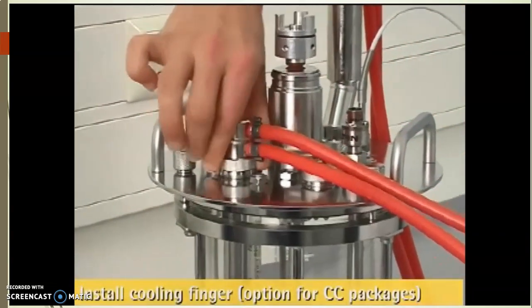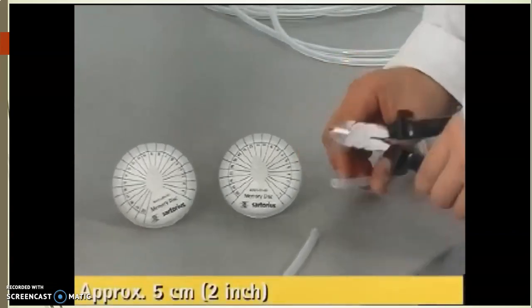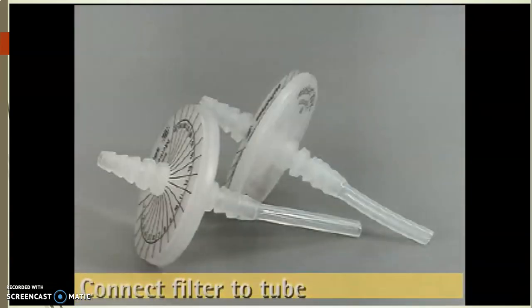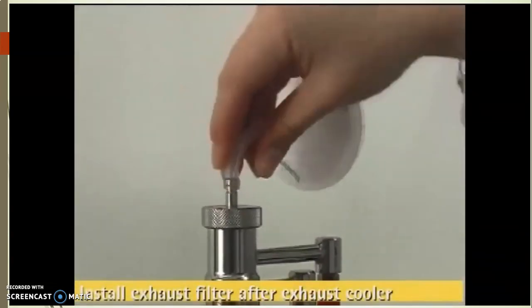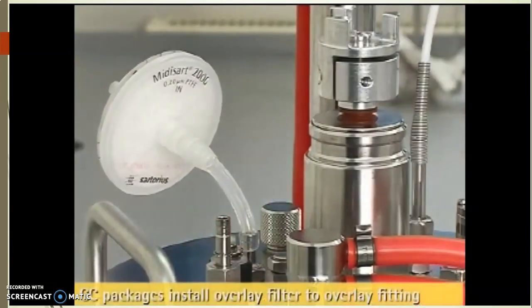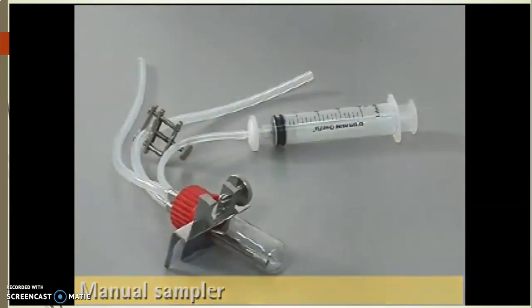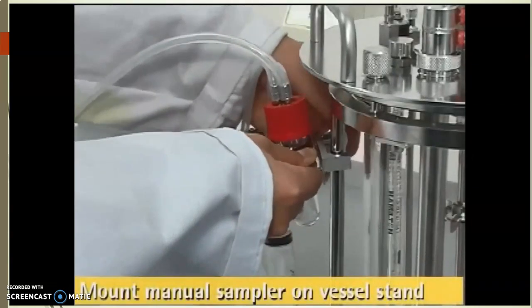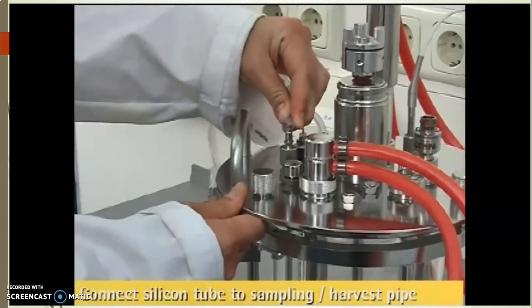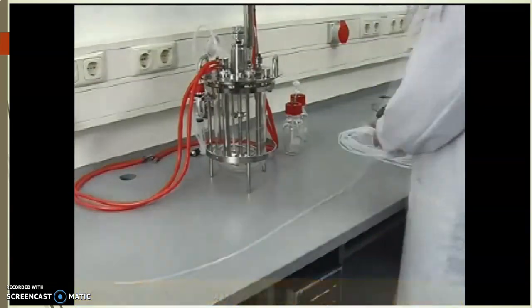You can see the different probes look different, so don't be confused. Cooling finger. Settings. These are the tubings for the filters to exhaust the gases from the cooler condenser and from the sparger. Okay, so this is only a one-way filter. This is the manual sampler, which needs to be mounted on the vessel and connected to its ports.